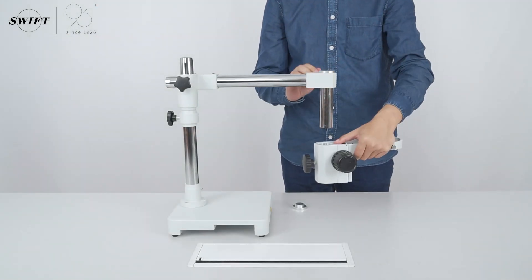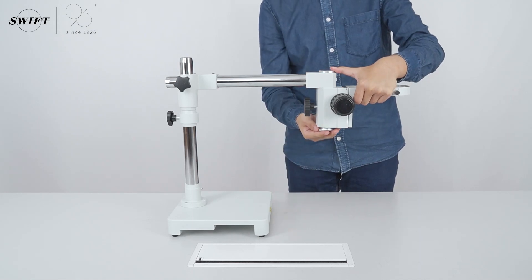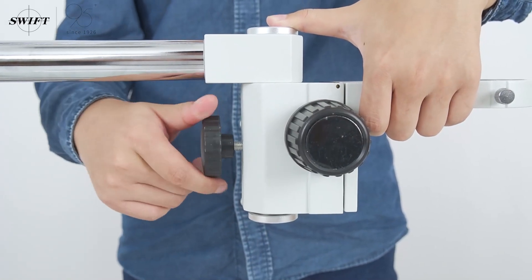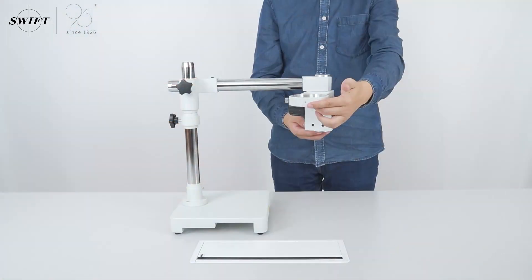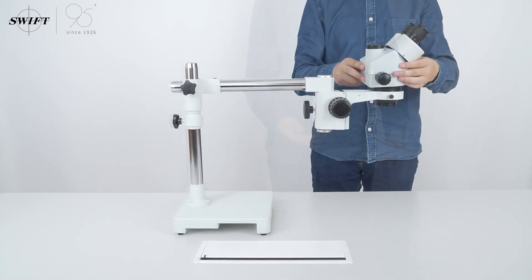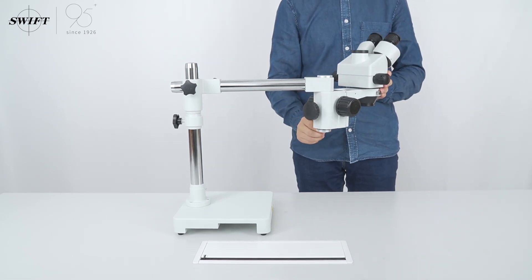After the installation of the frame, pay attention to the anti-slip and check whether the rotation is free. Install the mirror body host and tighten the screws to check the observation mode.